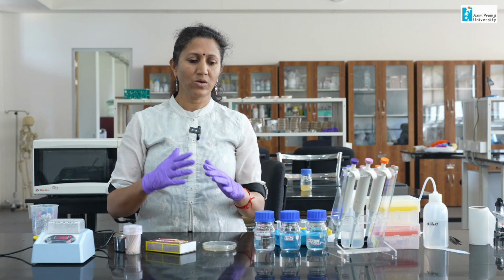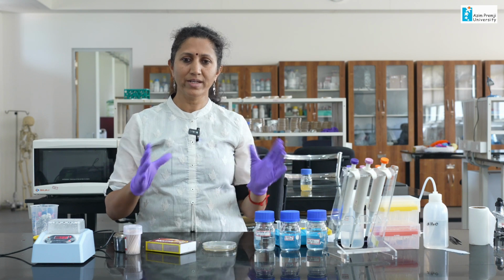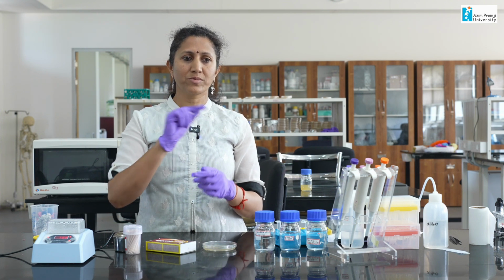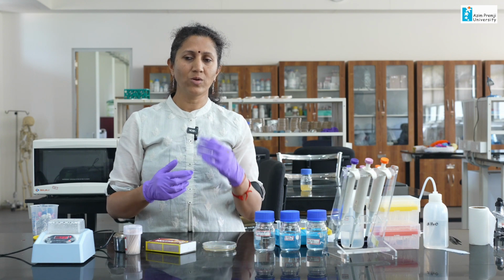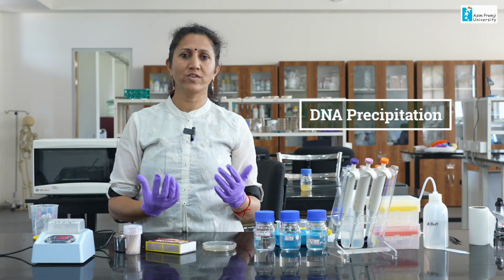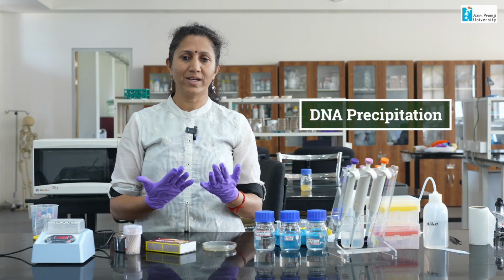The third step: now you have removed the cell membrane and degraded the protein which is not required. Now you have to centrifuge and take out the debris. You will be left with a liquid which has the DNA. Now we need to take out this DNA from the liquid part that we have.